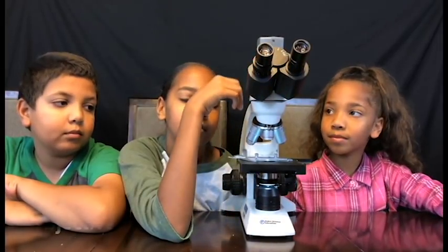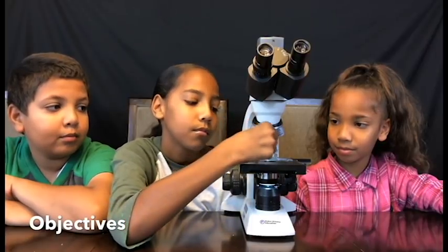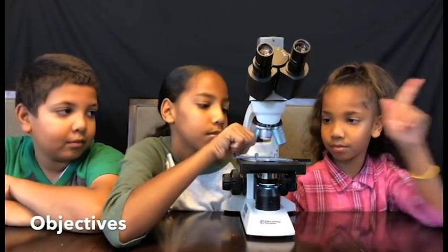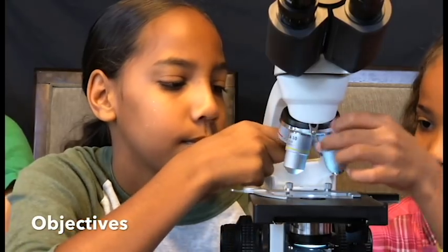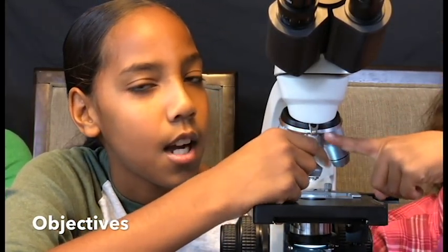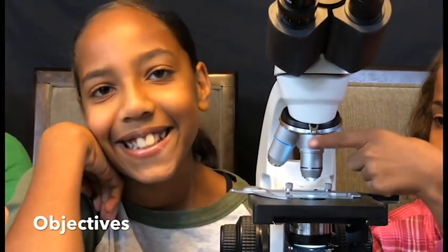Can you point to the objective lens? That's the ocular; that's the objective. This particular microscope has four different objectives. The red one is the scanning objective. The yellow is the low power — that's 10 times zooming. High power is 40 times zooming. And the oil immersion objective is 100 times.